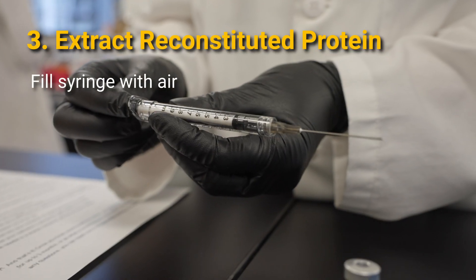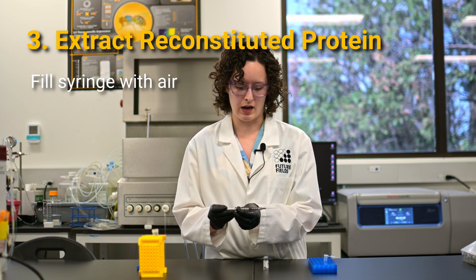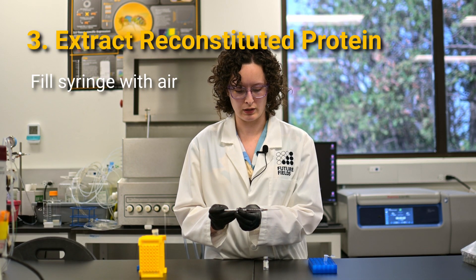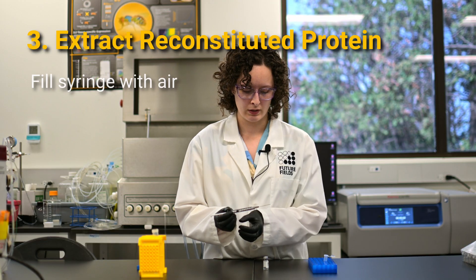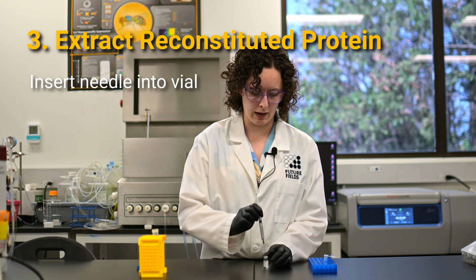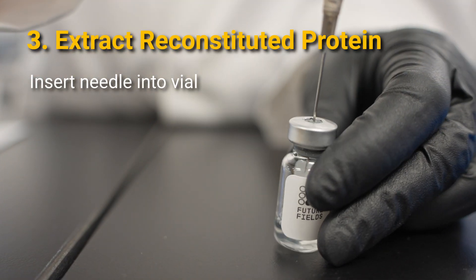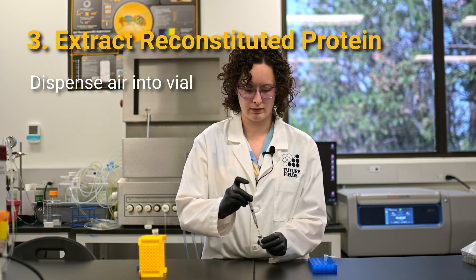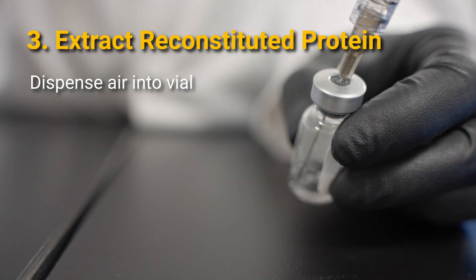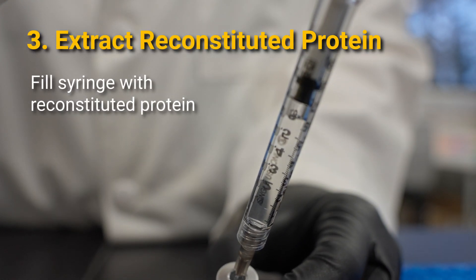Draw air into the syringe equal to the amount of protein you're going to remove from the vial. I'm going to remove all of it, so I'm going to use 750 microliters. Insert the syringe into the cap of your vial again, dispense the air into the vial to displace the liquid, and then draw up the liquid out of the vial.